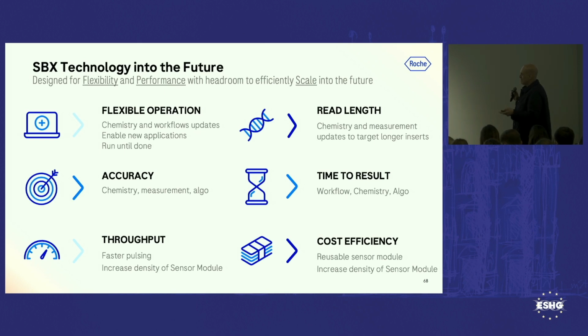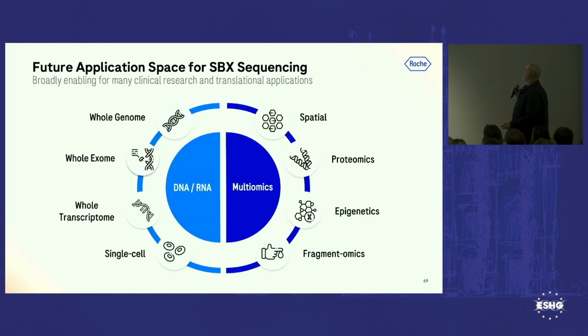This technology is still very early in our understanding of how to utilize SBX, and so we'll continue to hit on all of these fundamental optimizations as we embark on the next step of SBX as we get towards launching in 26. So a lot of things there, and I know this will probably come up in some of the questions, but next steps for us will be showing target enrichment, some methylation work, and a range of other application areas that are very interesting to us. So continuing to work on this and excited for the next steps, and I thank you.